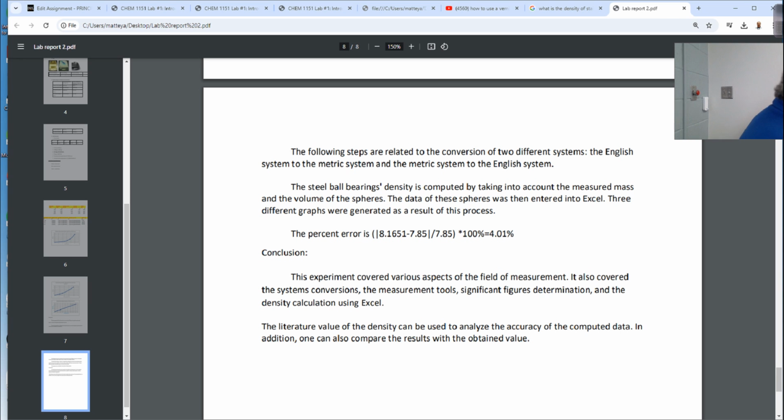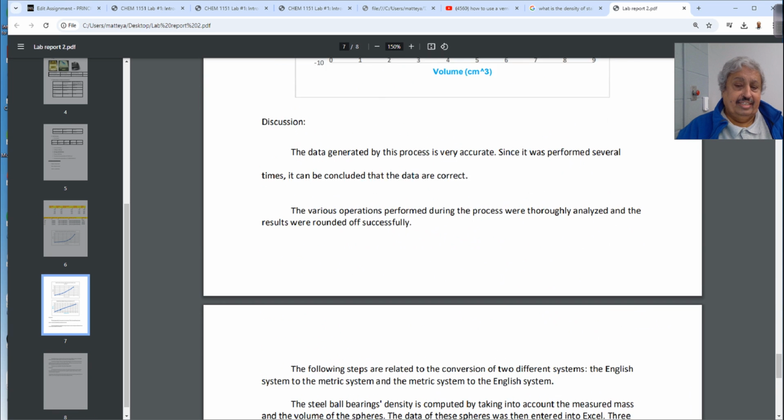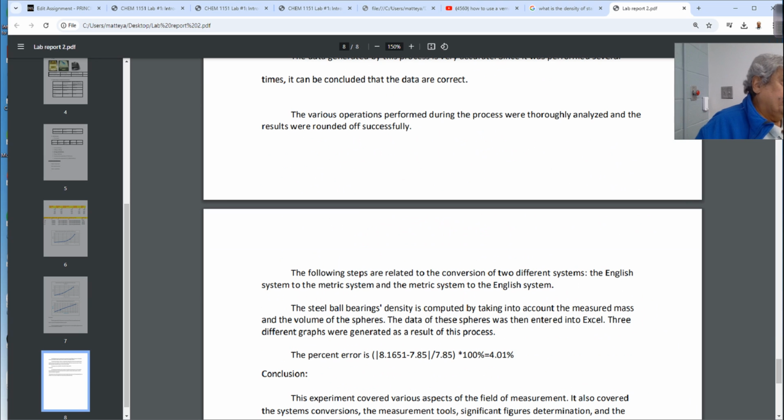First of all, you measure these 3 dimensions. Read those 2: the whole volume of the liquid, and how much the small subdivisions are. The theoretical ones are already inside. Then measure the mass of those 4, and measure the diameter using this. Any question? I'll put the data from these students here, because I like the percentage error. He got 4%, which is really very good.